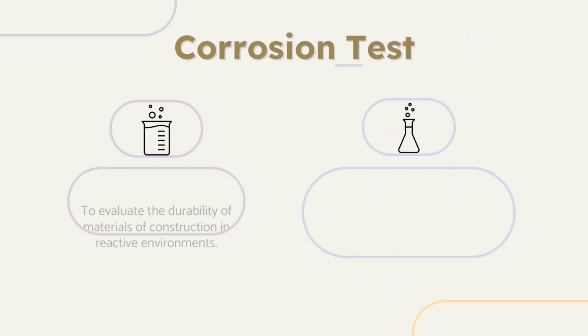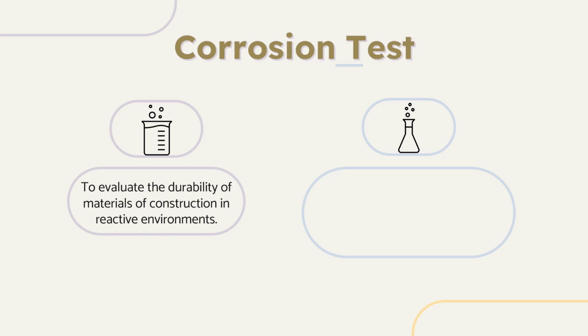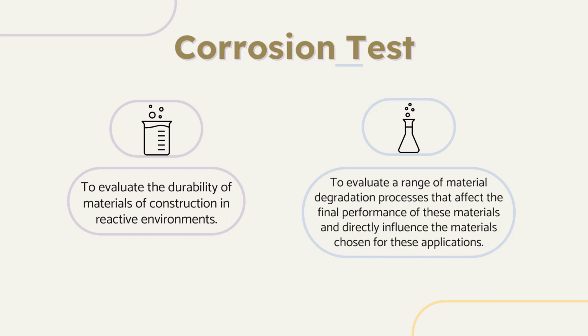Corrosion test is carried out to evaluate the durability of materials of construction in reactive environments. It is also to evaluate a range of material degradation processes that affect the final performance of these materials and directly influence the materials chosen for these applications.